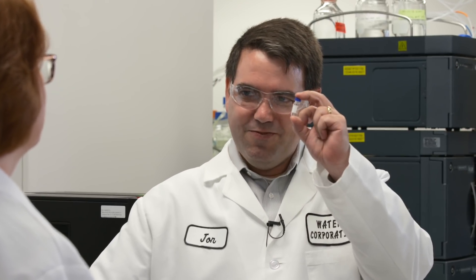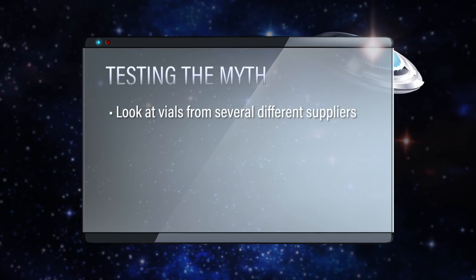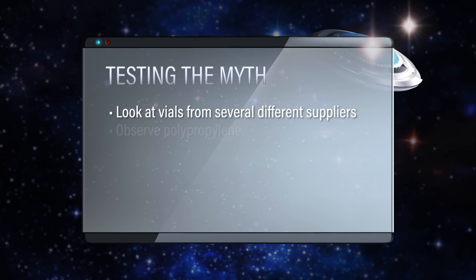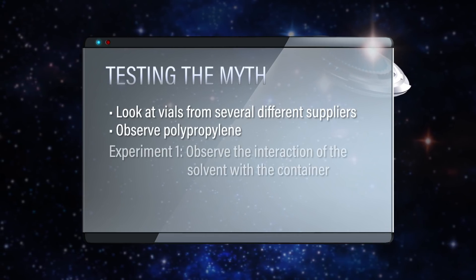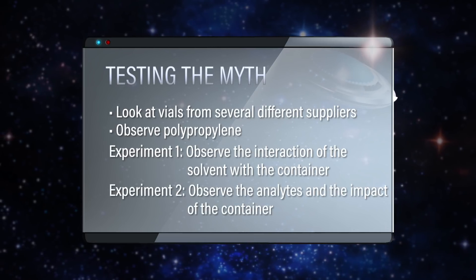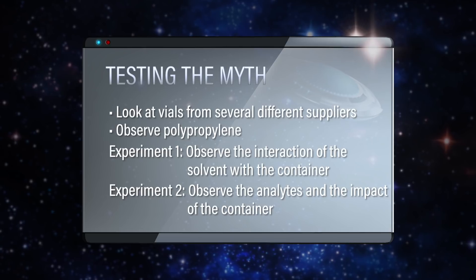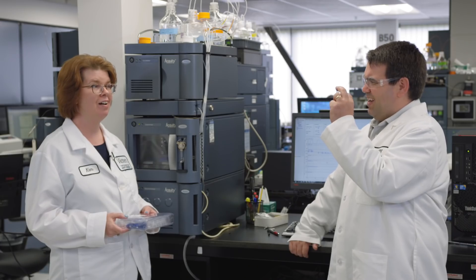Kim, I'm having a hard time believing something as insignificant as a vial could cause problems to chromatography. Look at it — it's just a little vial. You are going to be surprised. Let's set up an experiment. What we can do is look at vials from several different suppliers, and we'll also look at polypropylene just to make it interesting. We can set up one experiment to look at the interaction of the solvent with the container, and then also look at the analytes and see what the impact of the container is.